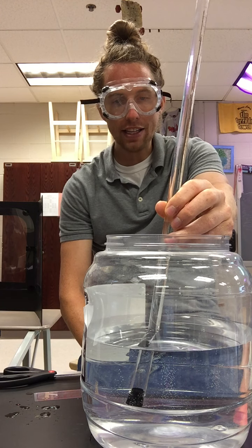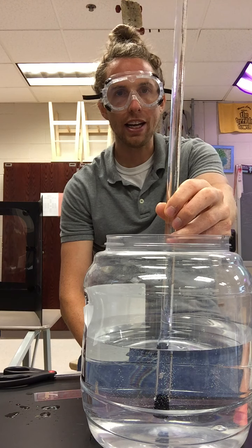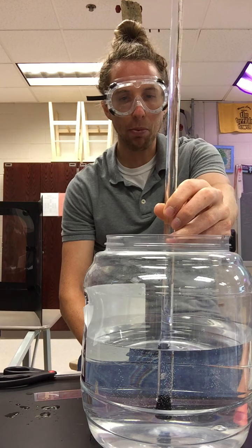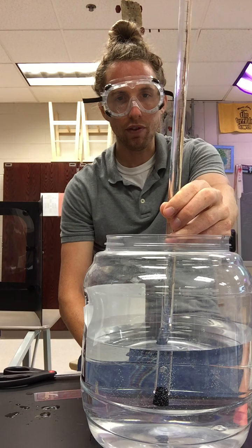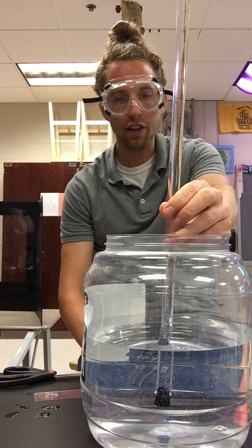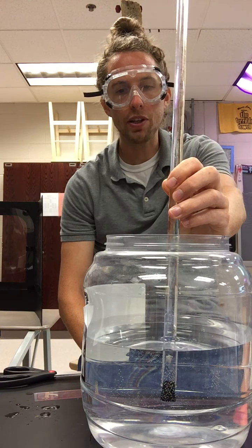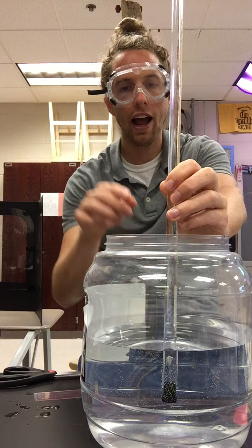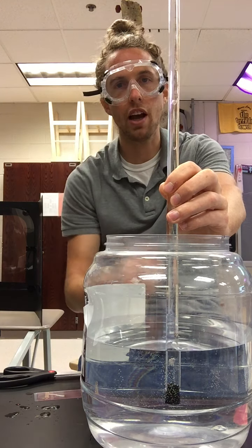So as the acid works its way down my eudiometer tube, eventually it's going to find that magnesium, and we should start to see some bubbles forming. Those bubbles are a gas being released. So I'm just starting to see the first bubbles. You'll see more of this as we progress. Now, bear in mind what's happening because I have this underwater. As those bubbles are forming, we can start to see those bubbles rising up towards the top.